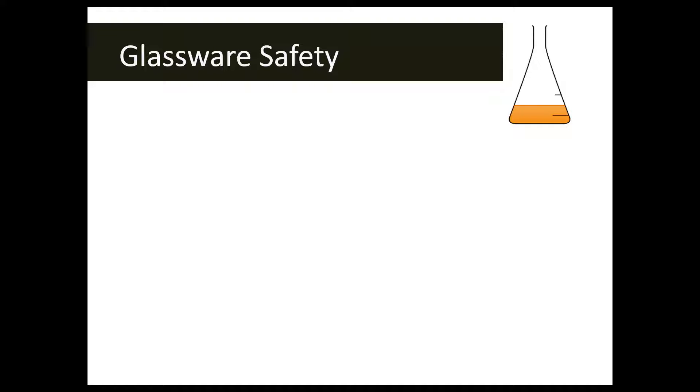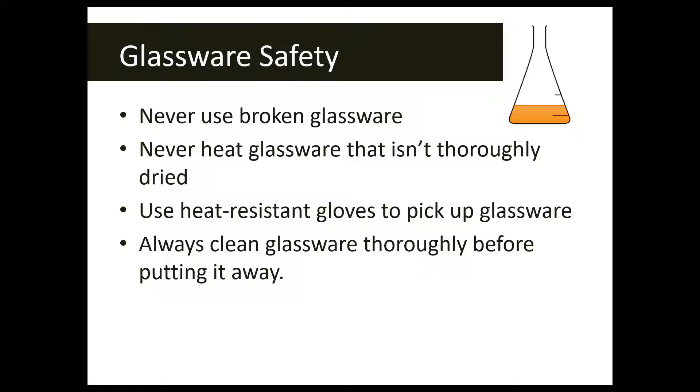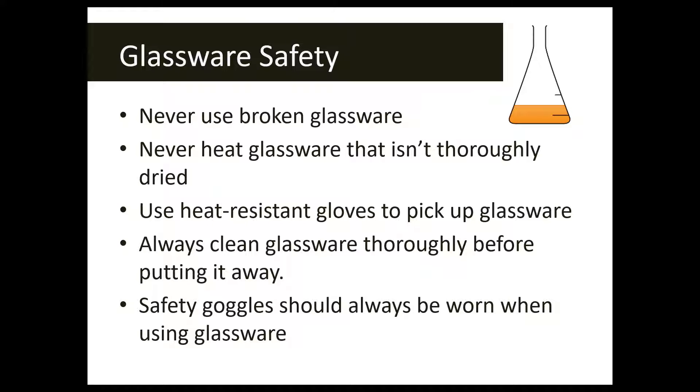The first symbol we're going to talk about is the glassware safety symbol, which is represented usually by an Erlenmeyer flask. This symbol means that you are going to be working with something made of glass — a test tube, a beaker, an Erlenmeyer flask, or a thermometer. Make sure you never use broken glassware; it's a good habit to check your glassware before you start a lab to make sure there are no cracks or chips.